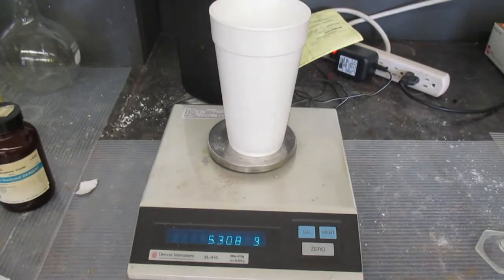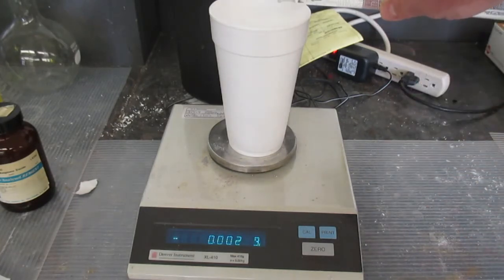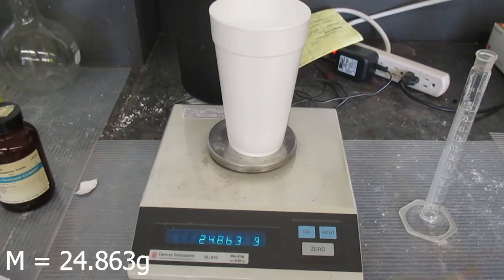So the first part of this is that we need 25 milliliters of acid, and we're going to determine the mass of that. What I'm going to do is tare or zero the scale with the styrofoam cup, and I'm going to add the 25 milliliters of acid to the styrofoam cup, and we want to record the mass of that. And so the mass of the HCl is 24.863 grams. Let me repeat that, please. The mass of the HCl is 24.863 grams.